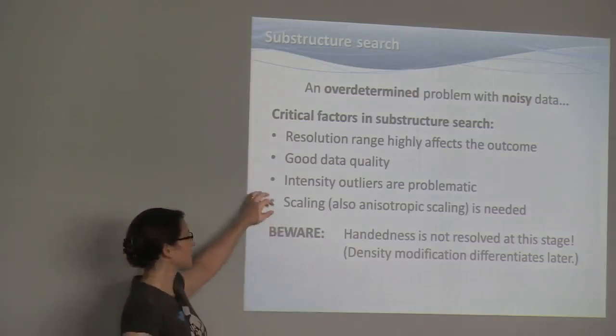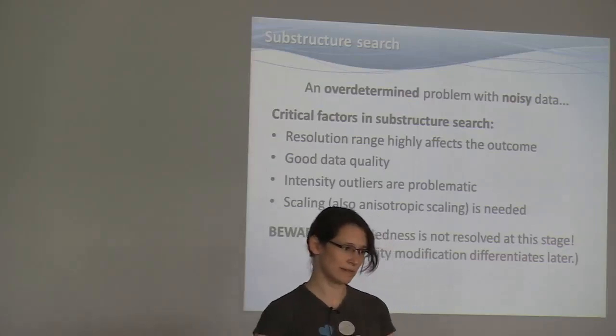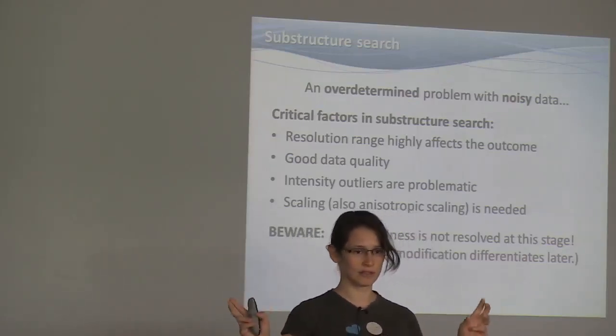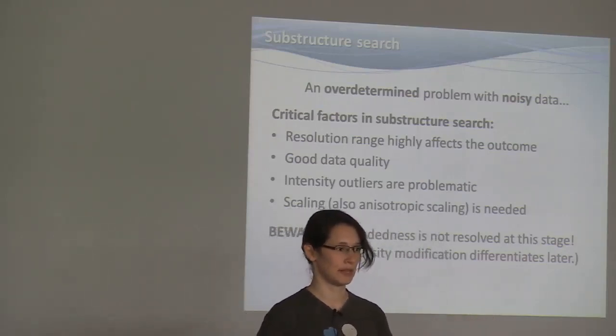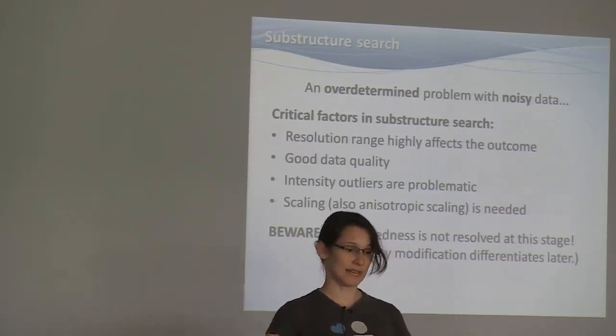You need good data quality. Intensity outliers are very problematic. At a conference a few years back, I was presented with a structure that was unsolvable and only solved when half of the data set was deleted. What had happened is the beam stop mask was not exact.